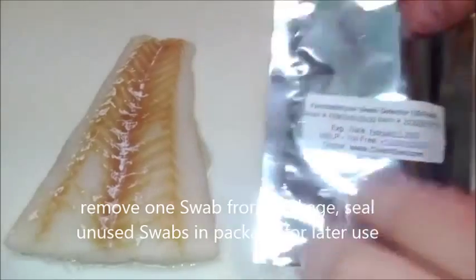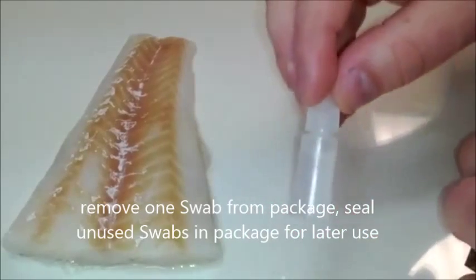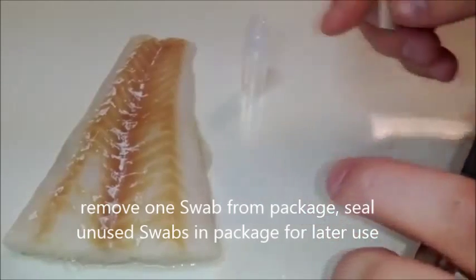Right before you are ready to conduct the test, remove a detector and the provided water bottle out of the packaging, and seal any unused detectors back in the pack it came in.